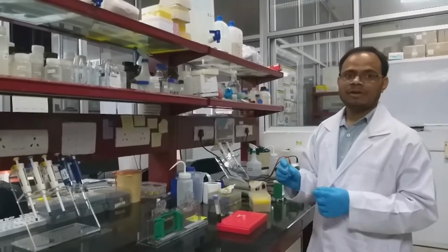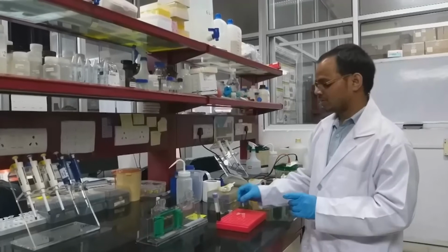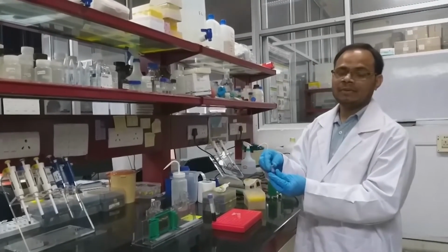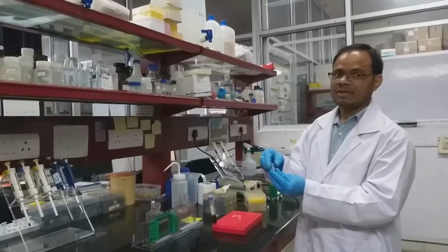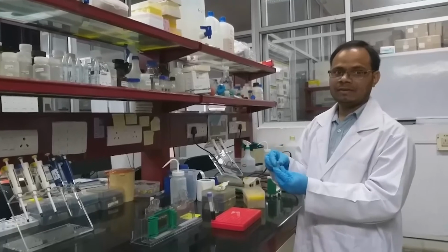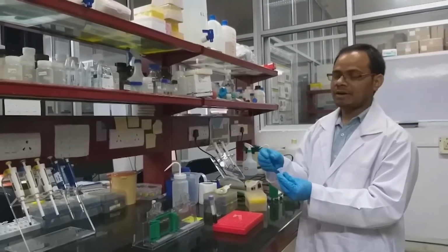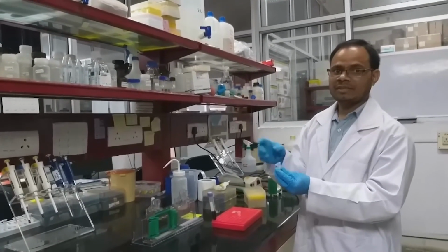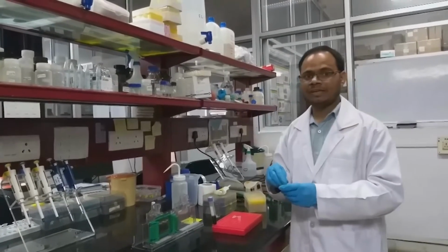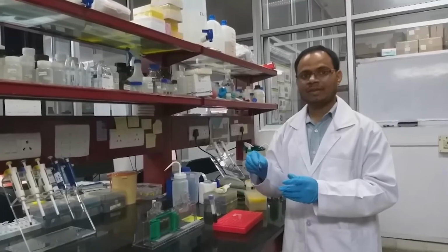You can tap down or pipette this protein solution. Then we have to heat it for 3 minutes at 100 degrees Celsius, so that all the polypeptide chains, dimers, or if any multimers are present, they will break down and we can see a nice band. So I am going to heat this at 100 degrees Celsius for 3 minutes.